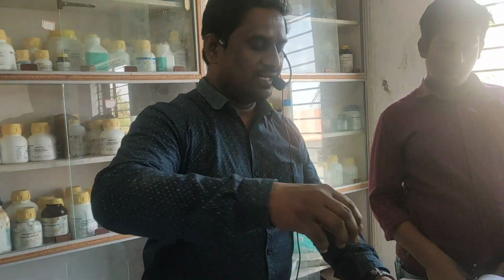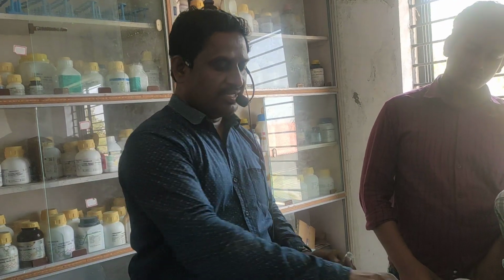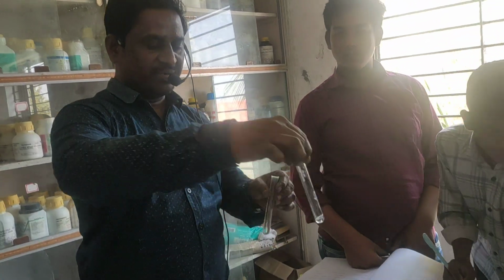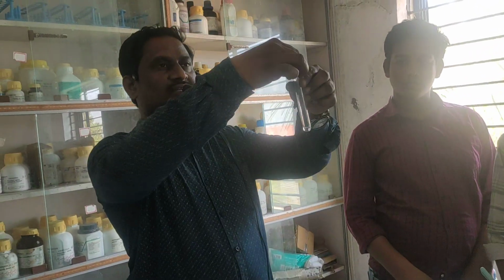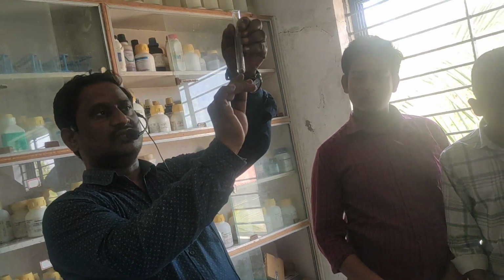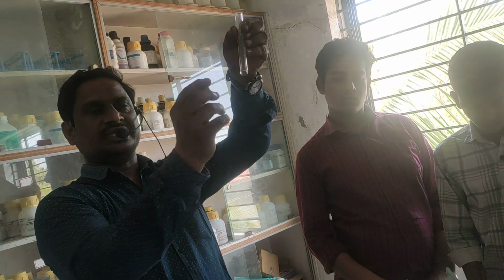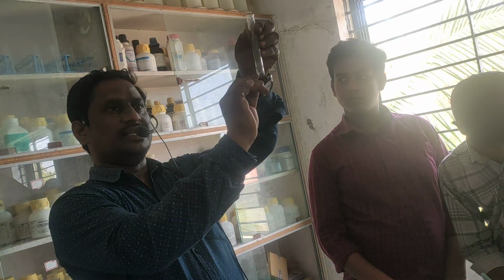Next, let us see the second test. Look here, all of you. No need to prepare again, children; it is already there now. For the second test, original solution plus dilute HCl, you have already prepared. So don't put the doubt again. The original solution with dilute HCl is already there.